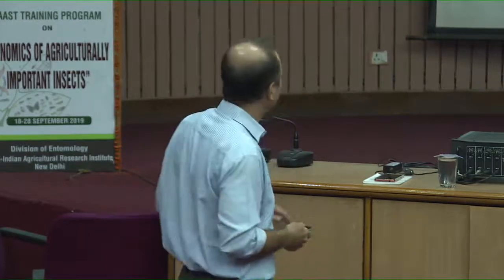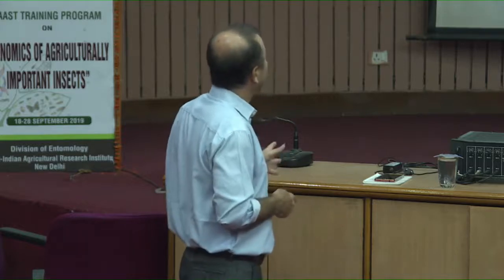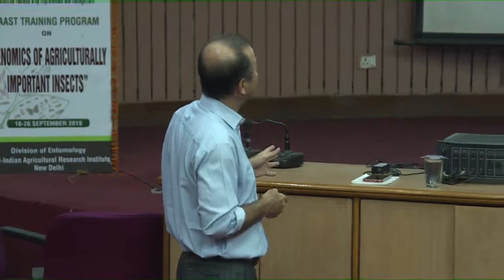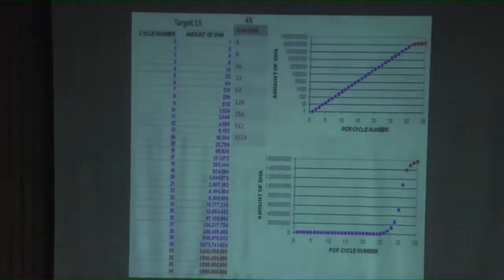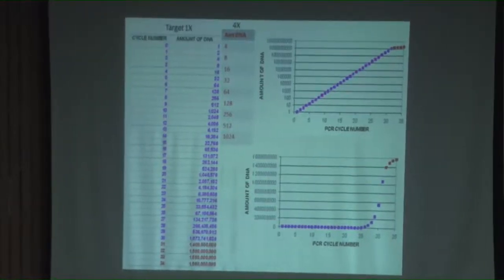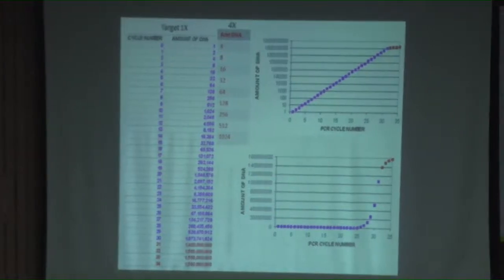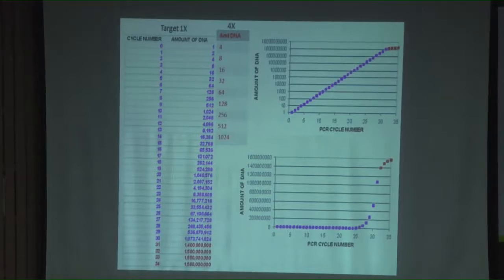So, as the PCR goes on, the amount of DNA will straight away increase 10, 100, 1000, like that, you will get this graph, and then you will reach what we call a plateau. You will reach a certain point where the increase is not in geometric progression, or the increase is not in the logarithmic phase. It is the same as microbial growth, you know, if you study microbial growth, you get the same kinetics. So, after a certain point you reach the plateau.